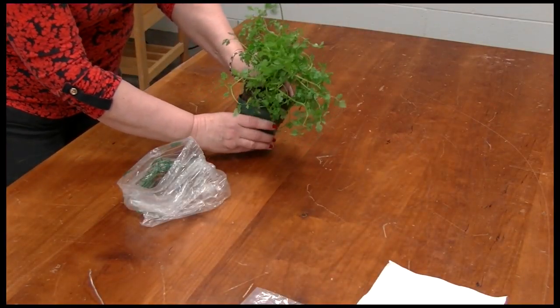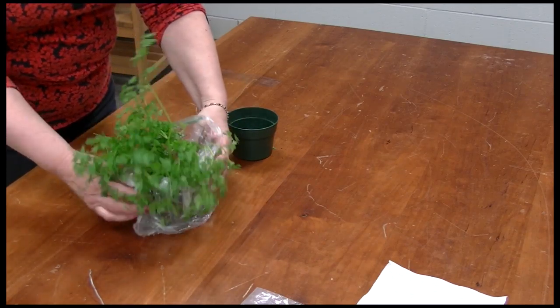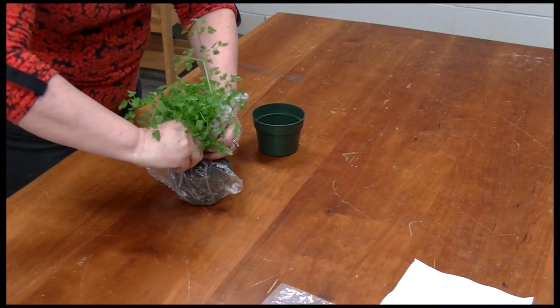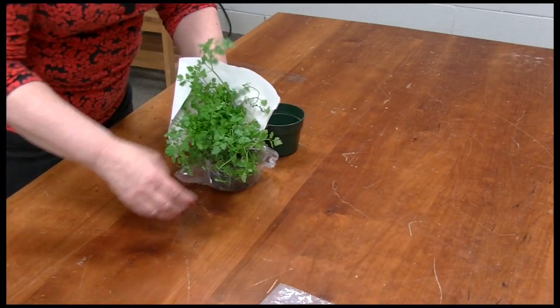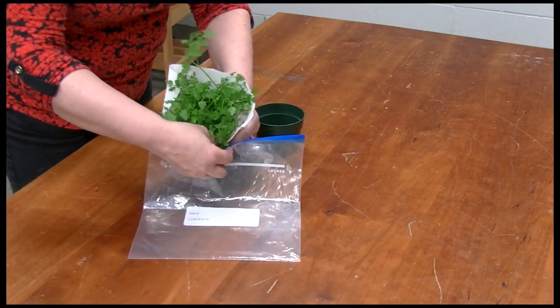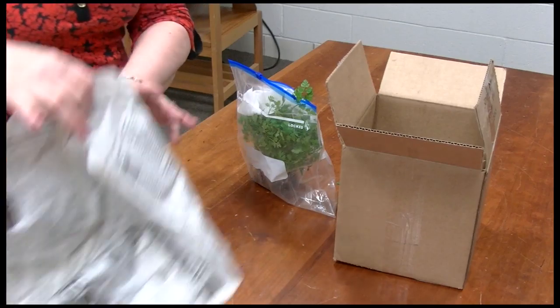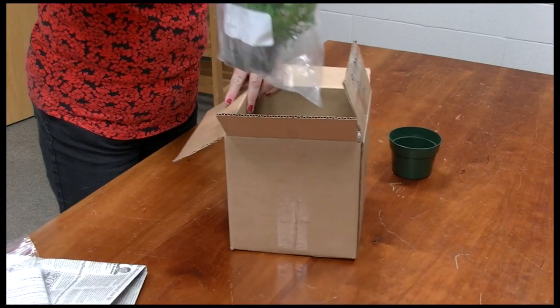Small whole plants can also be mailed to the Diagnostic Lab. Remove the plant from the pot or dig a plant from the soil. Try not to pull the plant from the soil because some of the roots left behind might be important for an accurate diagnosis. Wrap the root ball in a plastic bag and seal around the stem with a twist tie. Be sure to put some paper towels around the foliage to avoid condensation on the leaves. Place the whole plant in another plastic bag and avoid sealing the plastic bag completely. Pack in a box with some padding to be sure the plant doesn't bounce around during shipping.